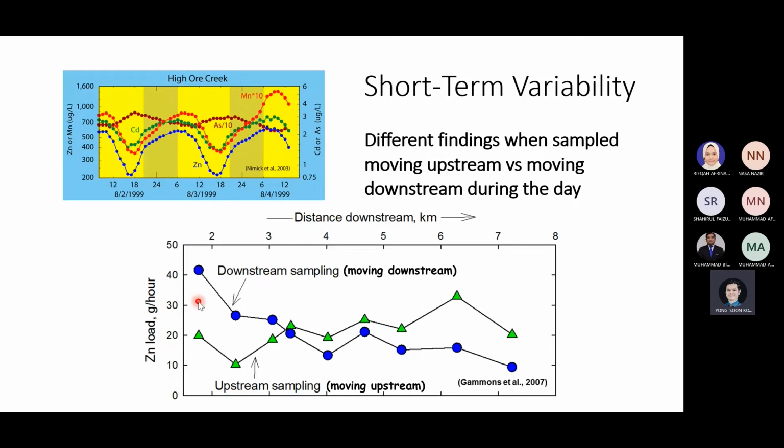And this is also one more thing that we need to pay attention to lah before we go and collect a water sample. When there is a disturbance, it does not represent the original state of the river water. It becomes polluted because we, the sampler, disturb the water. It does not represent the river water. Okay, so invalid lah. So you have to remember, when we collect water samples, we have to know where we should start and where we should end. Yeah. After this, I'm going to elaborate further lah, about this one.